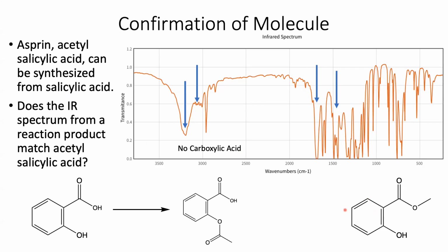It is worth noting that you can generate acetyl salicylic acid by treating salicylic acid with acetic acid. Instead, we treated the system with methanol, which generated the methyl salicylate. So again, methyl salicylate. Something to keep in mind again: sometimes the big thing here is we're looking for what is absent as well as what might alternatively be present. So this molecule really makes use of both skills.